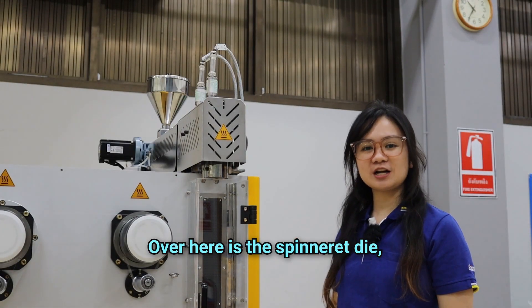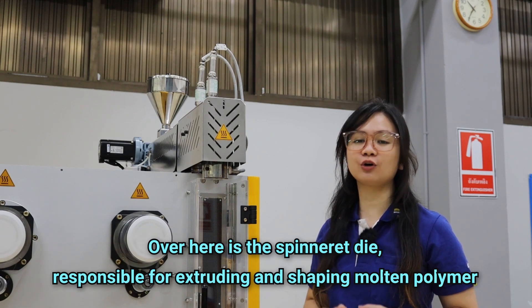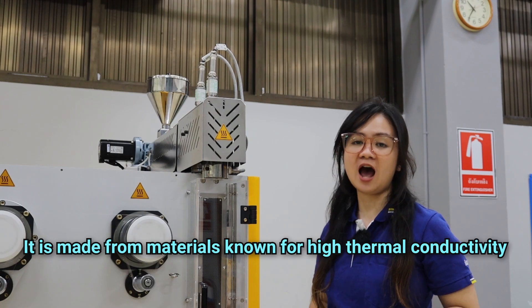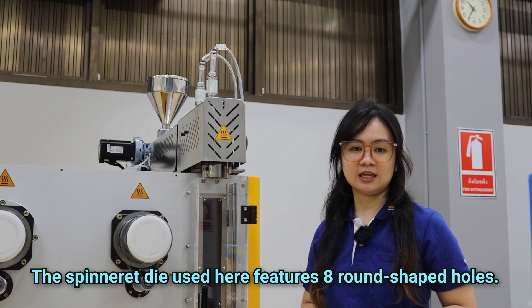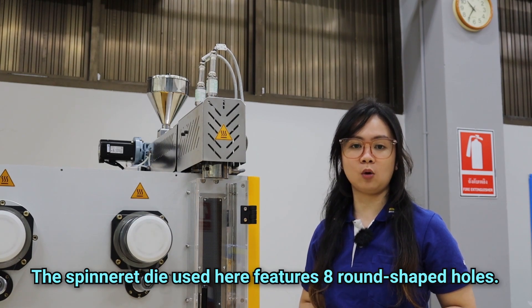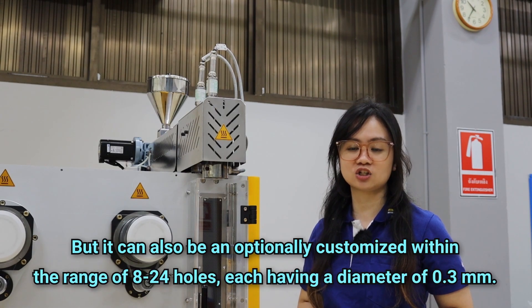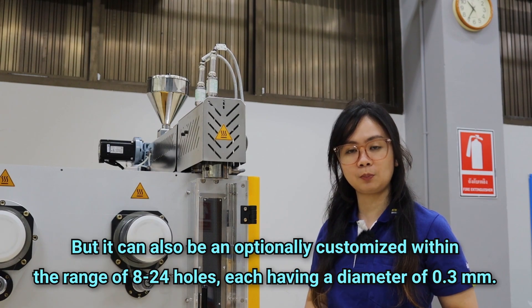Over here is the spinneret die, responsible for extruding and shaping molten polymer into continuous filament. It is made from materials known for high thermal conductivity and wear resistance. The spinneret die used here features 8 round-shaped holes, but it can also be optionally customized within the range of 8 to 24 holes, each having a diameter of 0.3 mm.